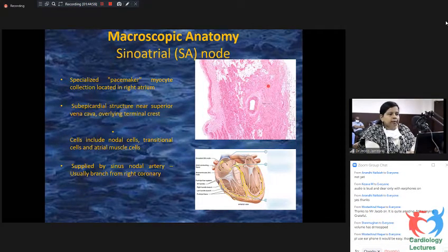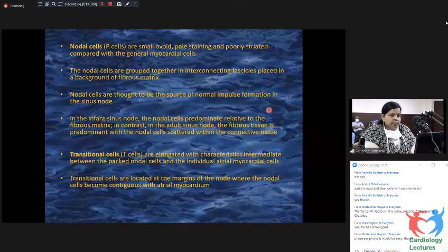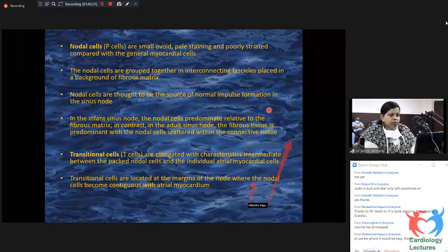It is not pathological fibrosis. And this is Masson's trichrome staining towards the annulus. So near the valves also there can be some fibrosis, and around the blood vessels, mild fibrosis can be present. It's not pathological. Pathological fibrosis will look like this. See, the muscle fibers are here, dark pink stained, and pale pink stained is the fibrosis, and it can be highlighted by Masson's trichrome. So this destroys the muscle fibers and there is fibrosis in between.